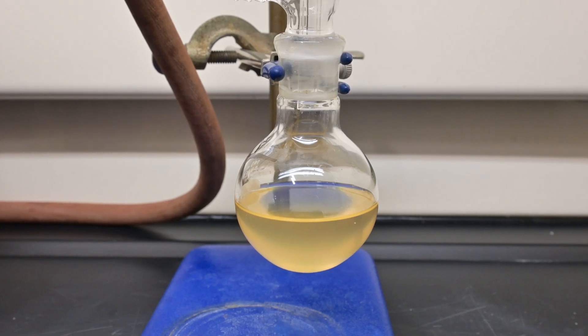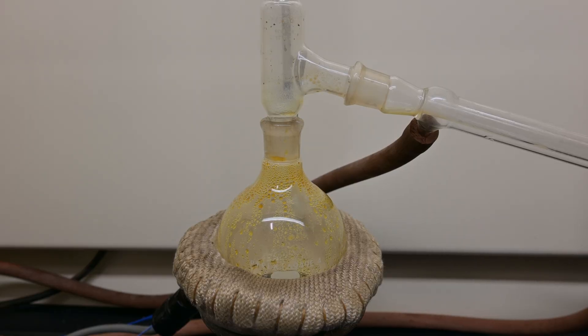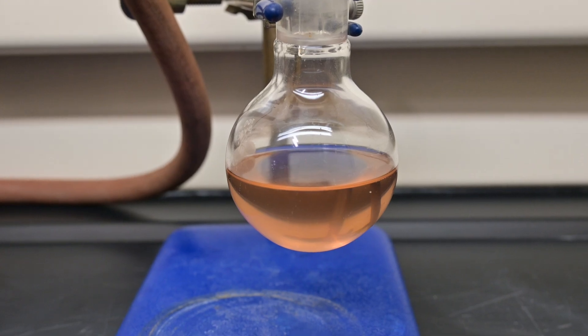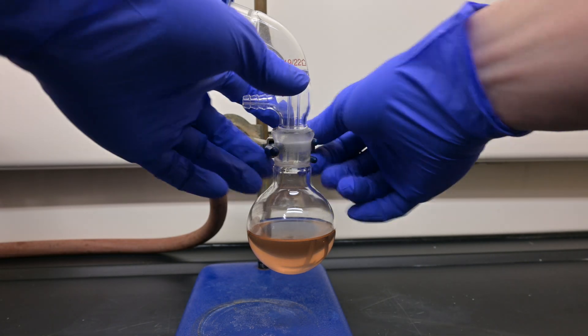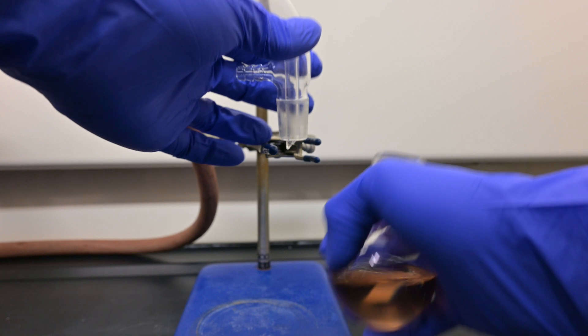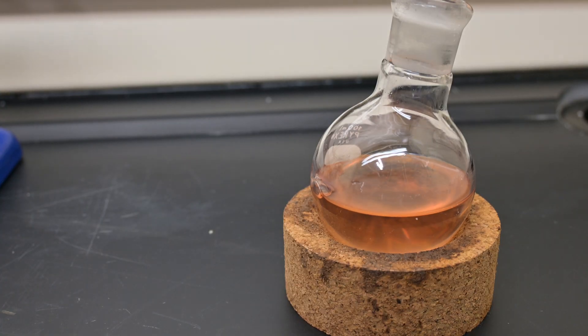I could have forced the temperatures up to get more product over, but the chemicals coming over at these high temperatures are most likely large fragment compounds from the reaction, not the styrene we want. I let the distillation setup cool before the next step. During that time, the crude product turned from a yellow color to a pink color. At this point, I took a small sample to compare it later.